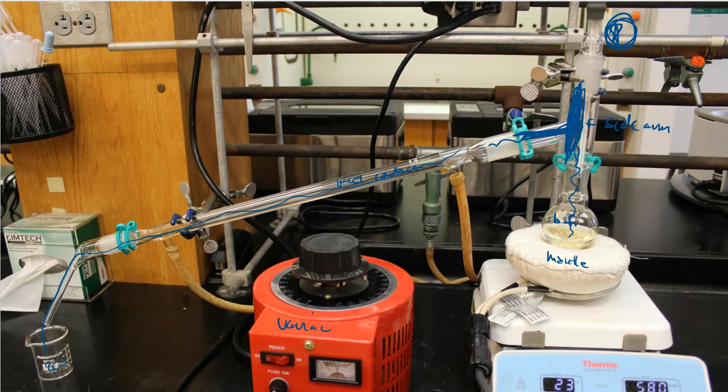All right, so there's the setup for what we call a simple pot distillation. That's the proper term for this setup that I have constructed, because it's very simple. It's a flask, a sidearm, and a condenser. That's all there is.